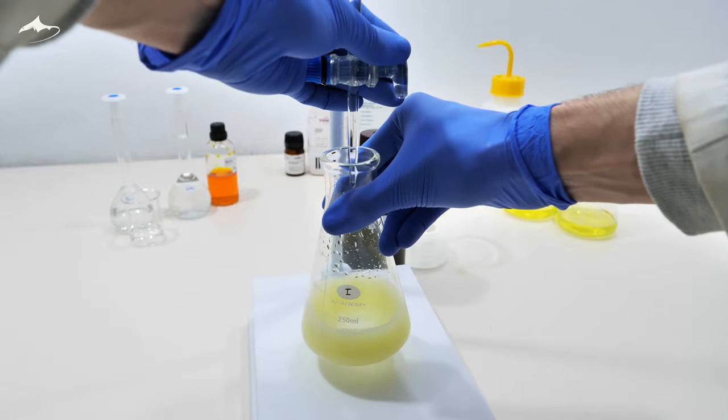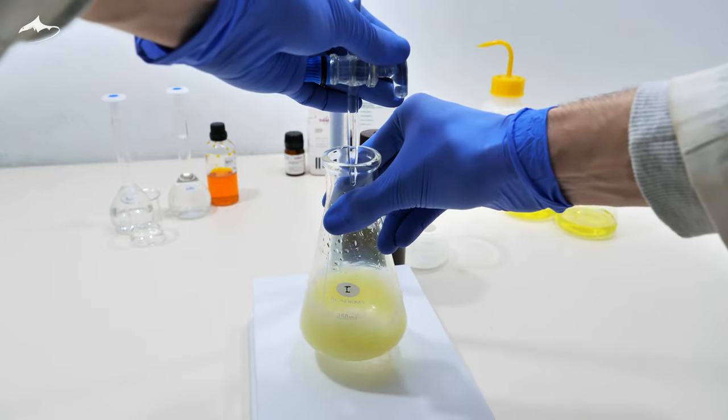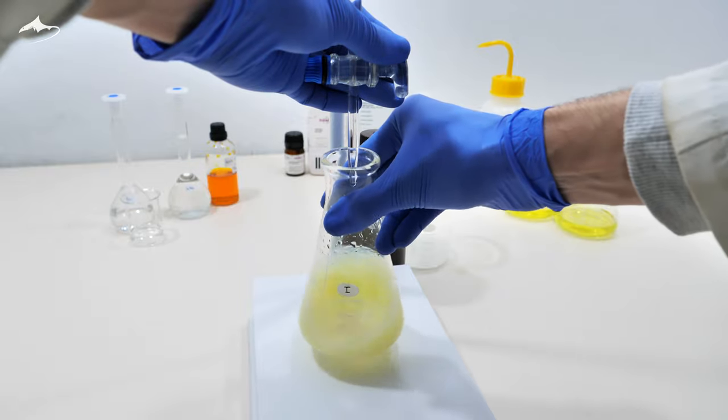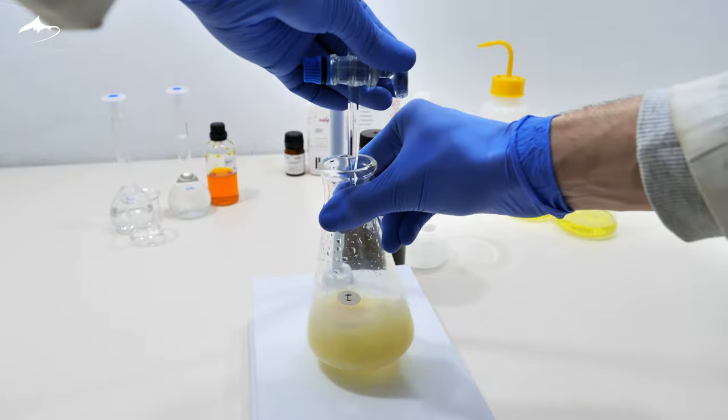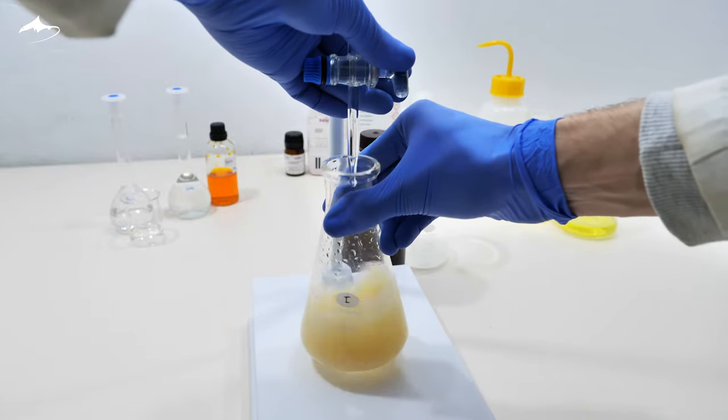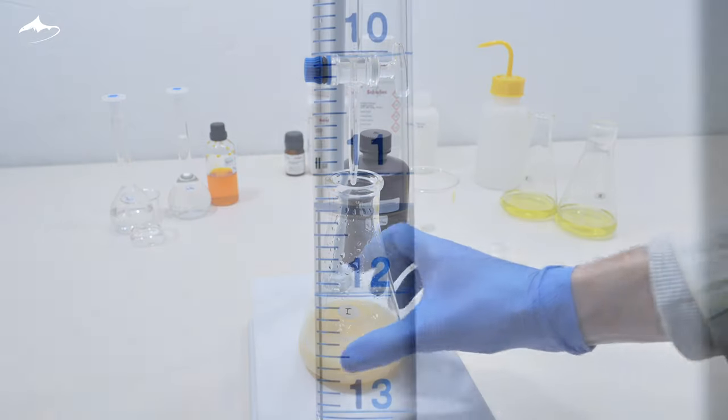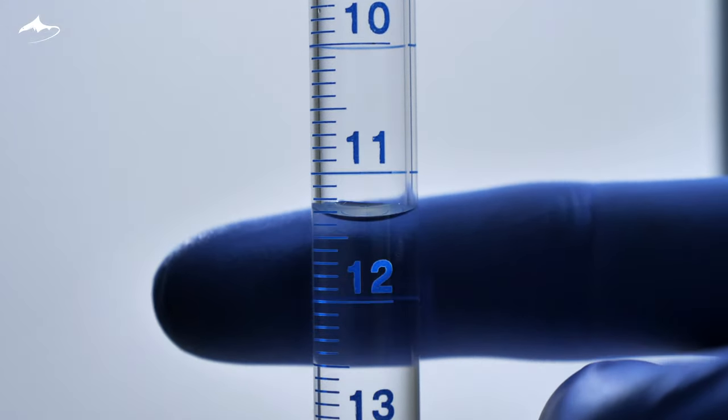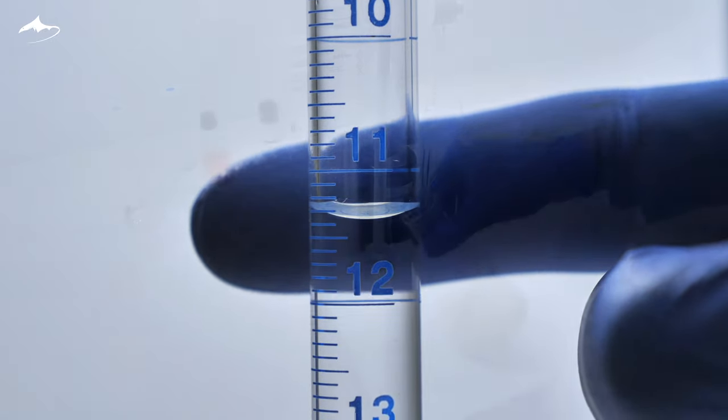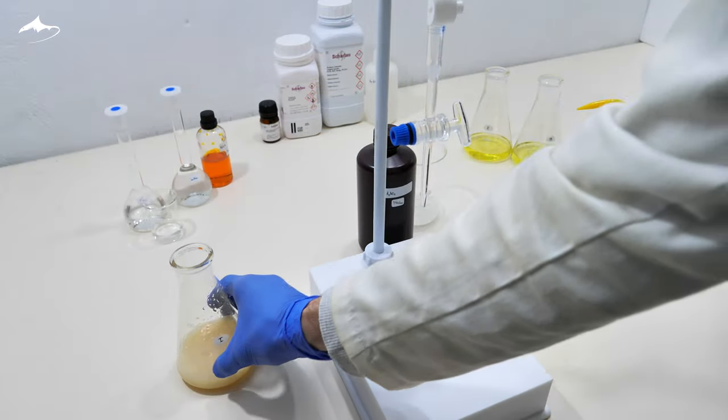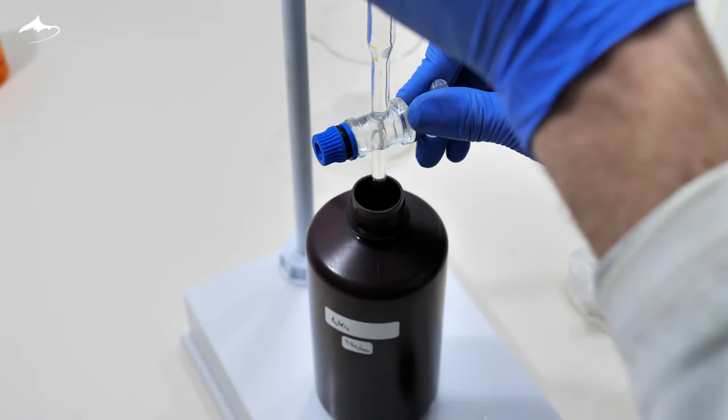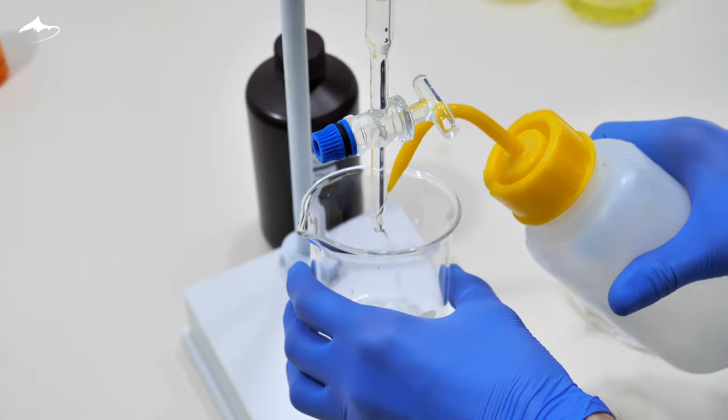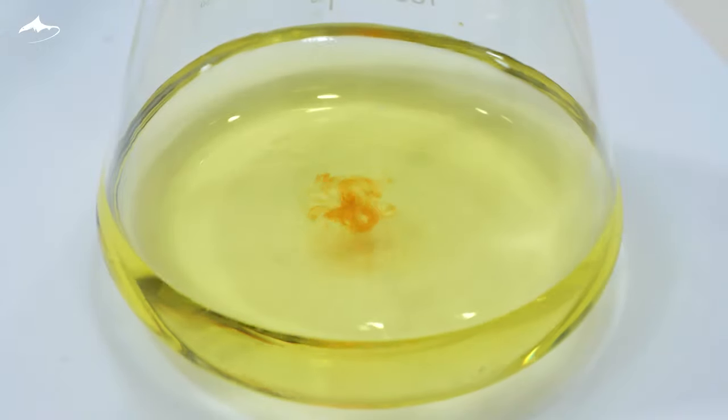Near the endpoint, additions are slowed to one drop at a time. And here is the endpoint. I added an extra drop by mistake, which is still okay since there are two more aliquots to titrate. In total, 11.4 milliliters are used. The value is recorded on paper and the process is repeated for the rest of the aliquots. Here you can see the formation of silver chloride after the red color disappears.